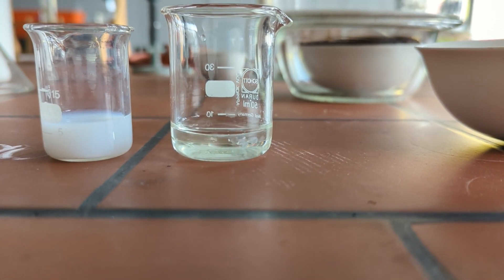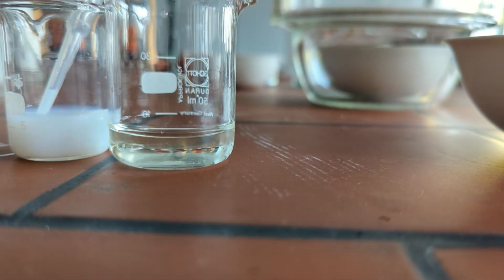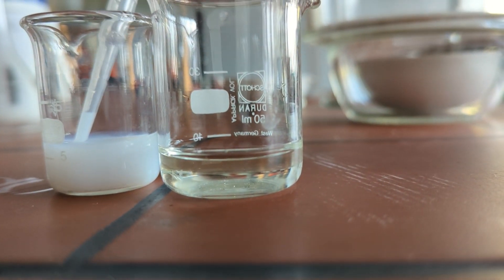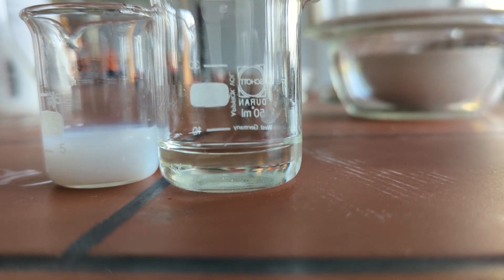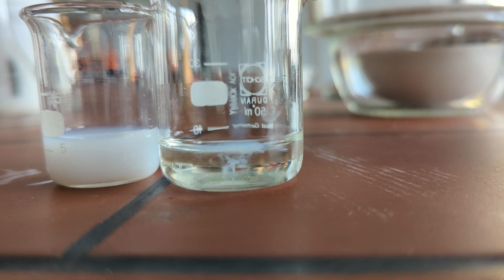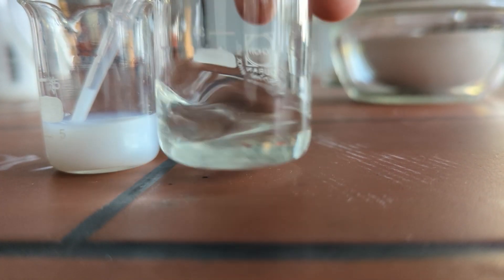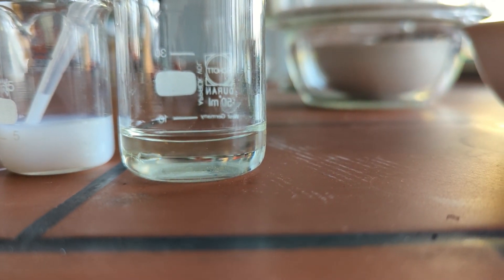As you can see, the silver chloride dissolves immediately. This indicates that there are enough cyanide ions to form a soluble silver cyanide complex.